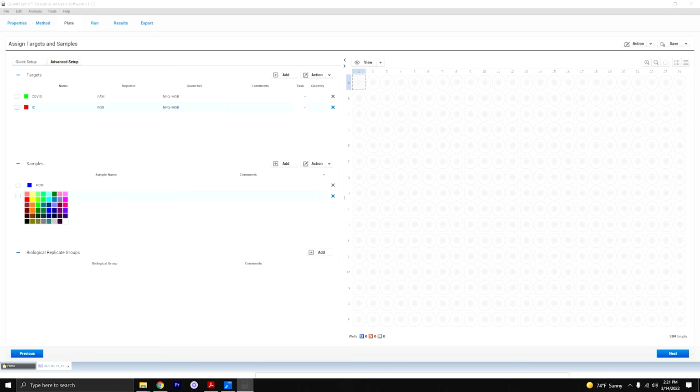Lastly, we're going to define the positive control media and the negative control media. So let's add. And this is PCM, its color is already blue, that's perfect. And secondly, we're going to add NCM, and this one is going to be orange. All right, that looks good.